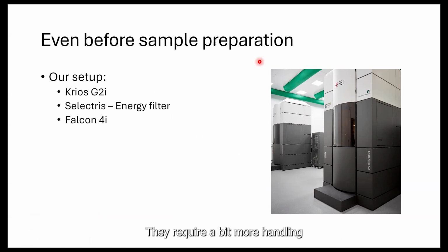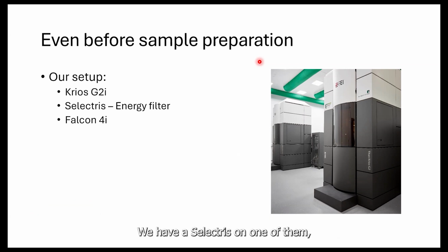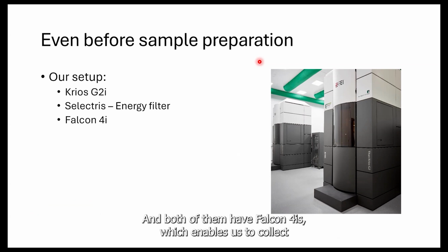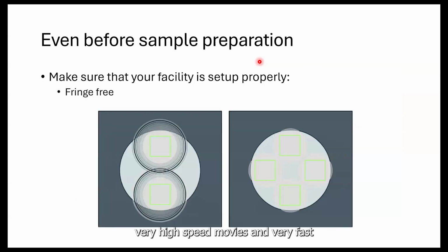They require a bit more handling and a bit more setting up. Our setup is we have two Krios G2Is. They're a bit old, but they can still do everything any other Krios can do. We have a Selectris, which is the Thermo Fisher energy filter, and both of them have Falcon 4Is, which enables us to collect very high speed movies very fast.